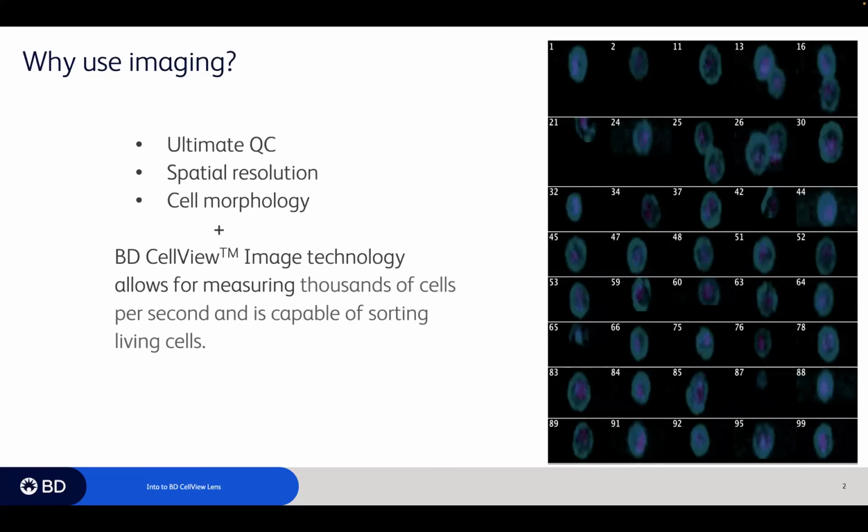Is the cell expressed in the membrane or not? How closely are various expressions packed? Are they on two different cells, etc.? And time and again, right after I was done being amazed that somebody was able to work out the details of some kind of algorithm or technique or approach, it occurred to me that they could have just looked at a picture and it would have been really simple and easy.